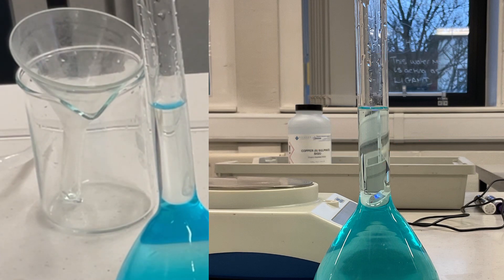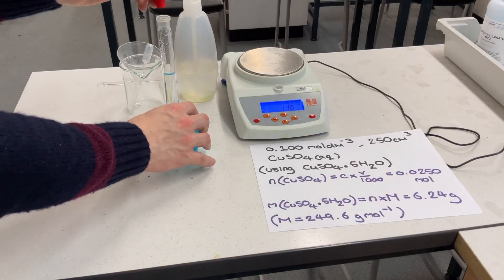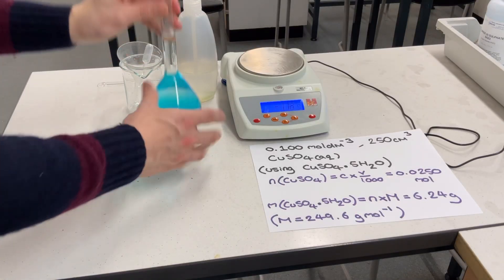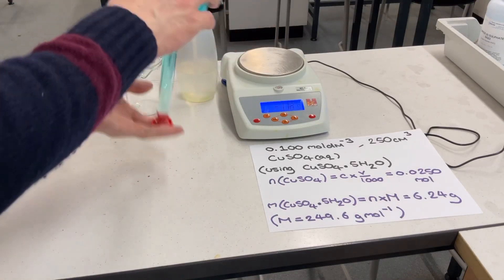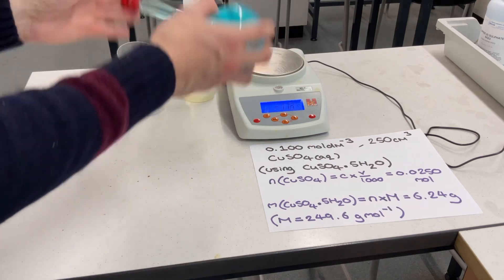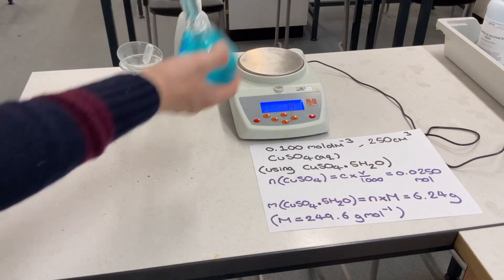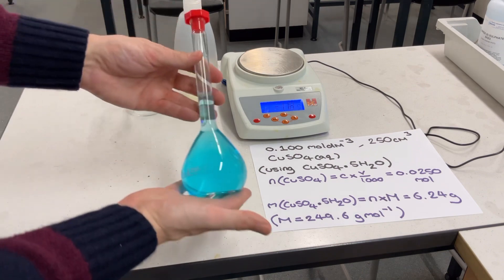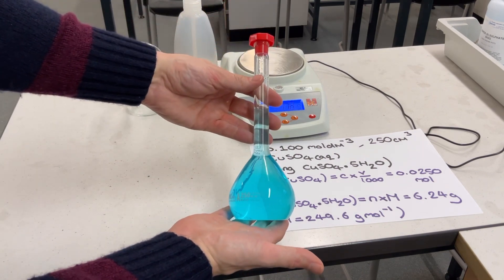Step 6: To finish, we stopper and invert the flask so that the solution is mixed and it has a uniform concentration. We don't typically suggest shaking the flask at this stage because it isn't a cocktail.